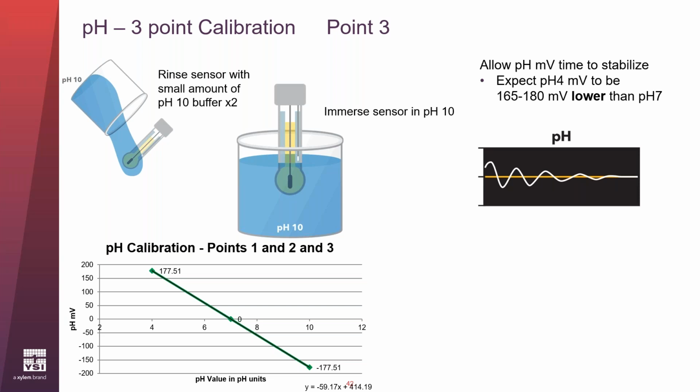If it's not automatically done by the instrument, accept the third point. This completes the calibration of the pH probe. Finally, our pH calibration chart is complete. We can see the entire slope. That right there is a perfect slope.